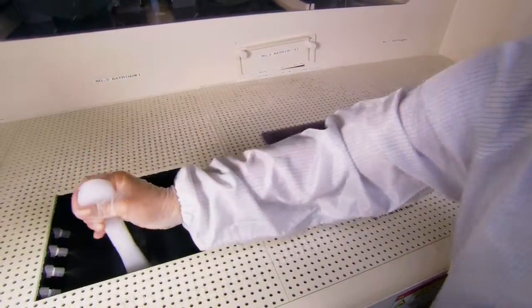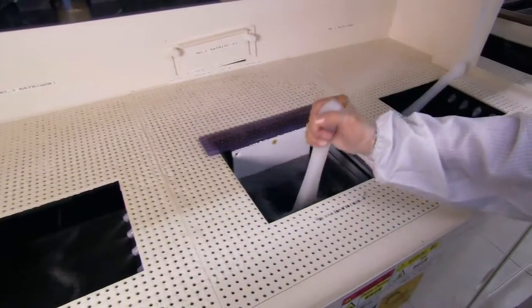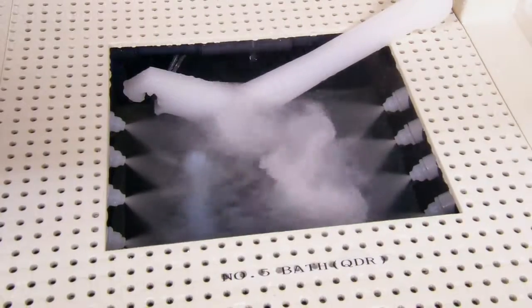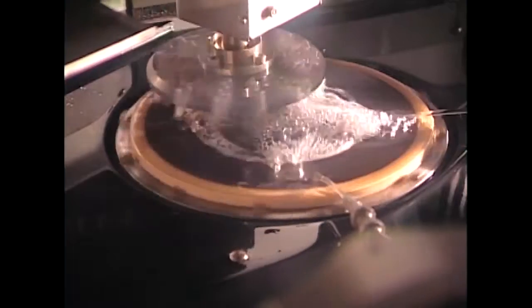When fabricating integrated circuit products, specific chemical solutions with nanoparticles are required in wet processing to clean, etch, and polish the wafer surface.